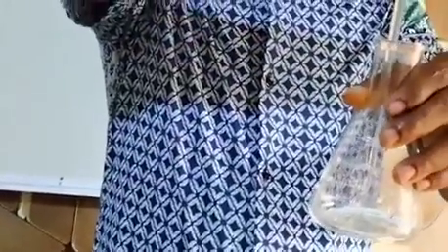So when the bottom of the meniscus sits on that ring, you have exactly 25 cm cube. It's almost there. So it's there. So we bring our conical flask, put it inside and allow it to run through into the conical flask.